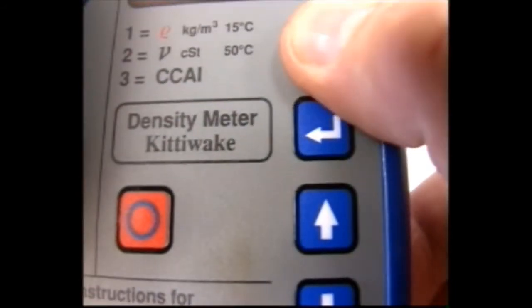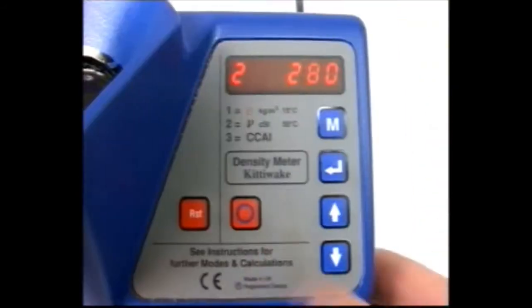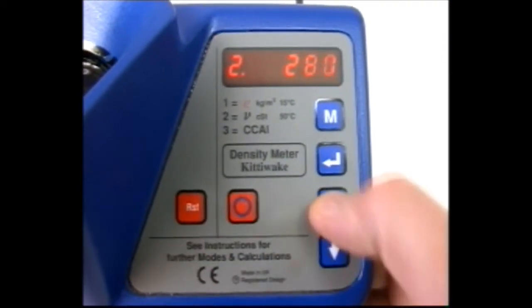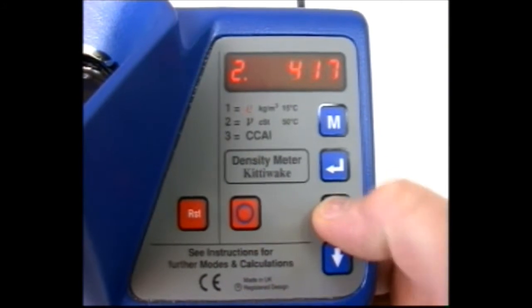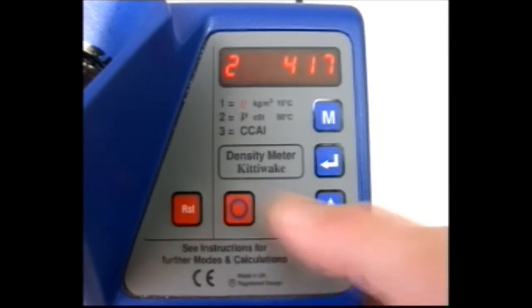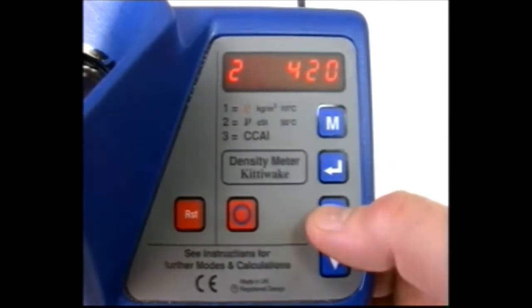Let's advance to mode 2. Select the oil viscosity in Centistokes at 50 degrees Celsius from the viscometer using the keys as before. Otherwise, use the default viscosity which is 280.